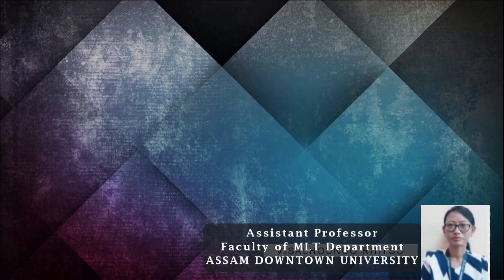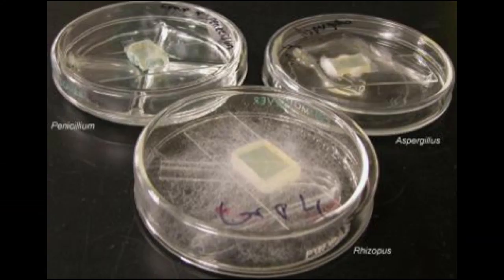In this video, I'll be explaining about the slide culture technique. This slide culture technique is a rapid method of preparing fungal colonies for examination and identification of fungi. Fungi are identified mostly by close examination of their morphology and the characteristics they possess. In slide cultures, the fungi are grown directly on the slide on a thin film of agar.